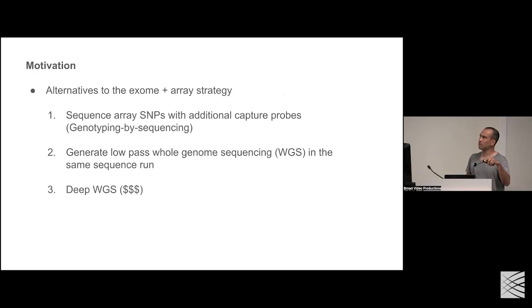The other approach is what I'll be talking about, generating low pass. And then obviously the be-all and end-all is deep whole genome sequencing, where you get it all, but the price point here is still quite a bit higher than either of these alternatives.